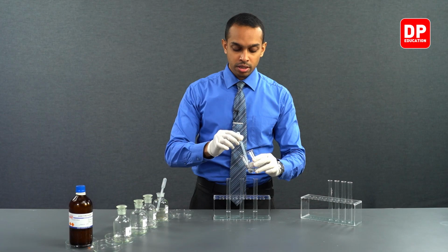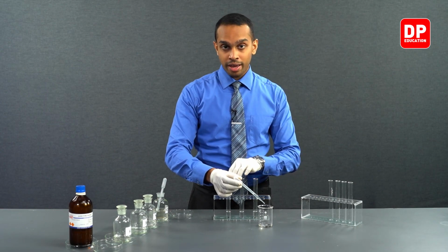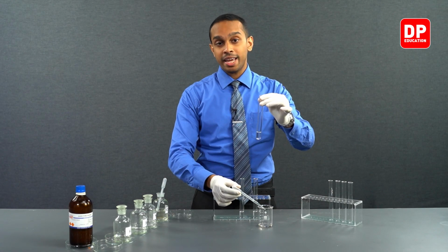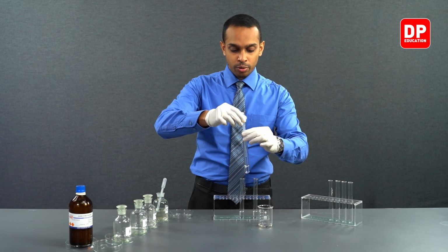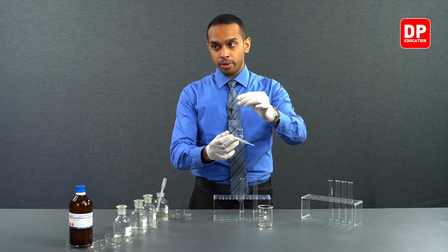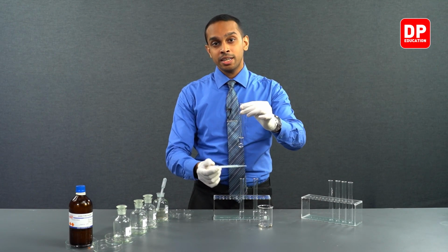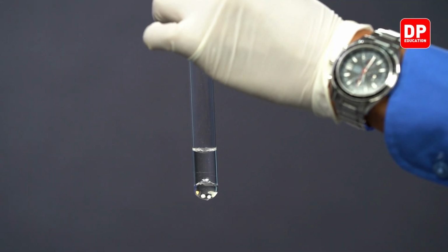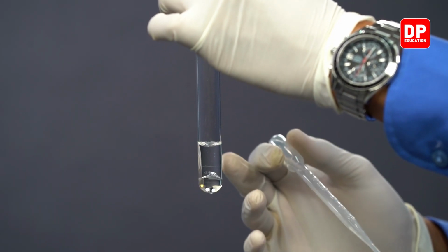Carbon tetrachloride, students, is a non-polar organic solvent which is denser than water. So what we have here is a sodium chloride solution. It's in aqueous medium. So when I add a little bit of carbon tetrachloride to this, I hope you can see this observation. The carbon tetrachloride sinks to the bottom. The reason for this is carbon tetrachloride, or CCl4, is denser than water. So it will sink to the bottom, and at the same time you can see clear layer separation. It will be present as 2 layers.